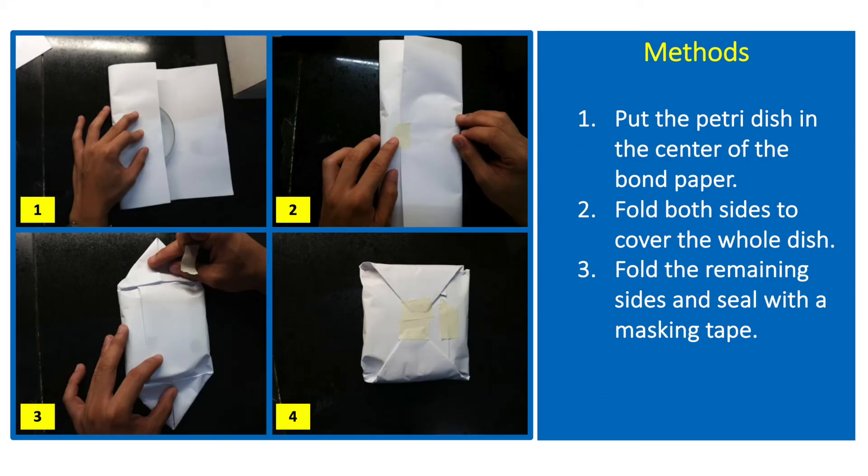Reusable glass petri plates are wrapped in bond papers to prevent contamination prior to the pouring of the culture media. Just lay a sheet of paper on the table, place the petri dish at the center, fold the longer sides of the paper until the two folds overlap, fold downward the remaining sides of the paper, then seal with masking tape.